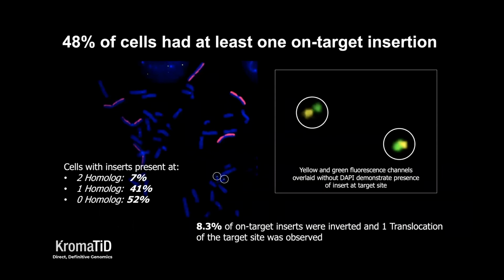Applying this design to practice, there was little or no random DNA damage observed inserting a 10 kb package into iPSC cells using a viral vector. Insertion, in fact, was quite successful, with about 1/2 of the cells, or 1/4 of the target chromosomes, having an on-target insertion. The structural integrity of the insert, furthermore, was also good, with only one translocation observed involving the target site.